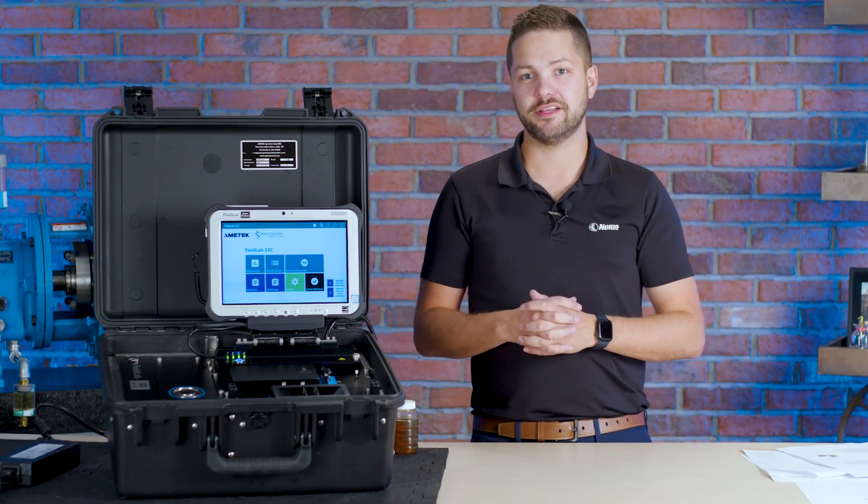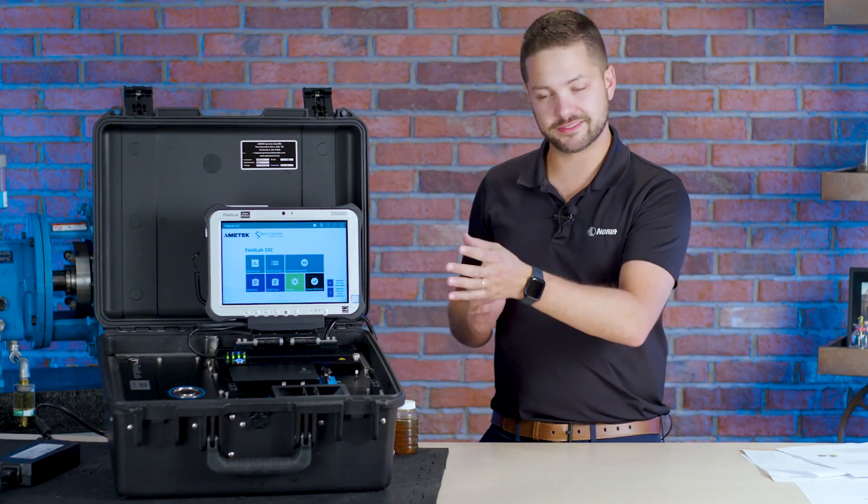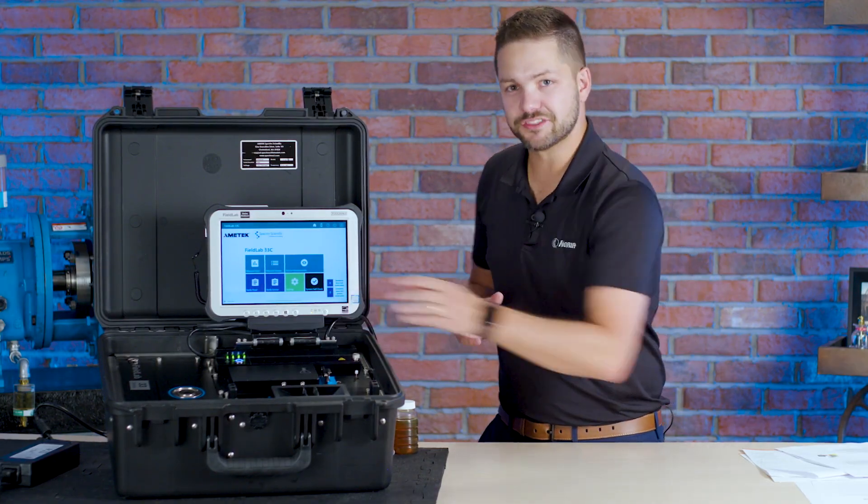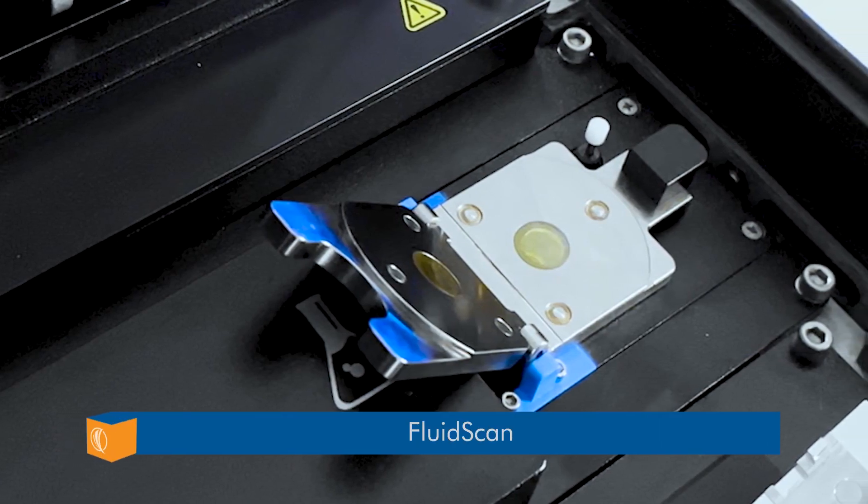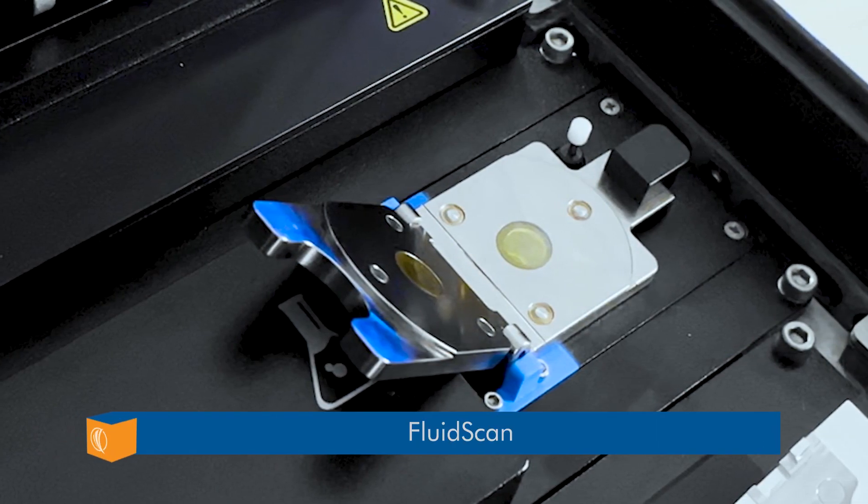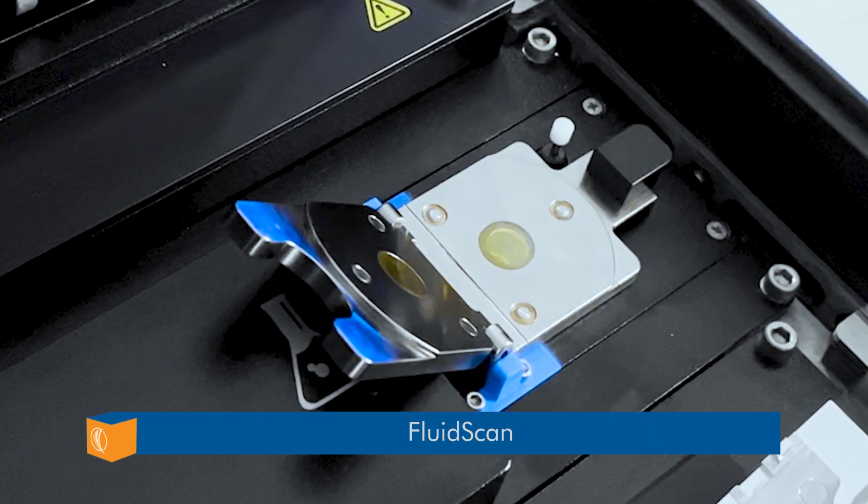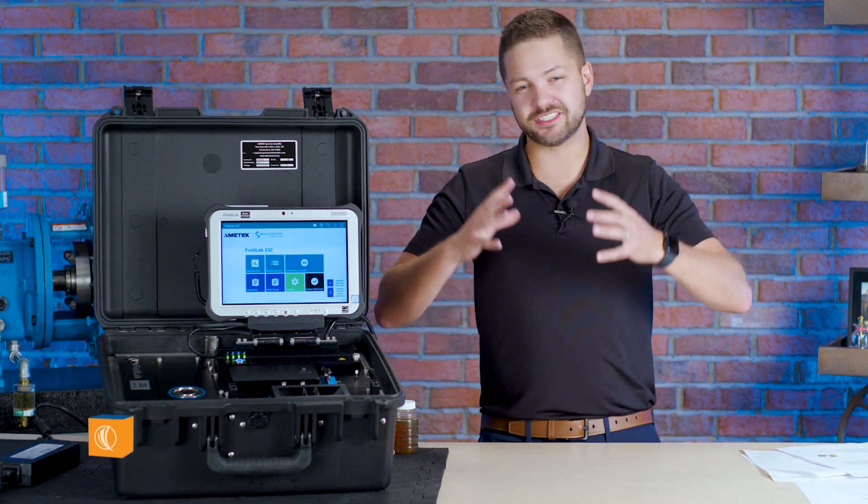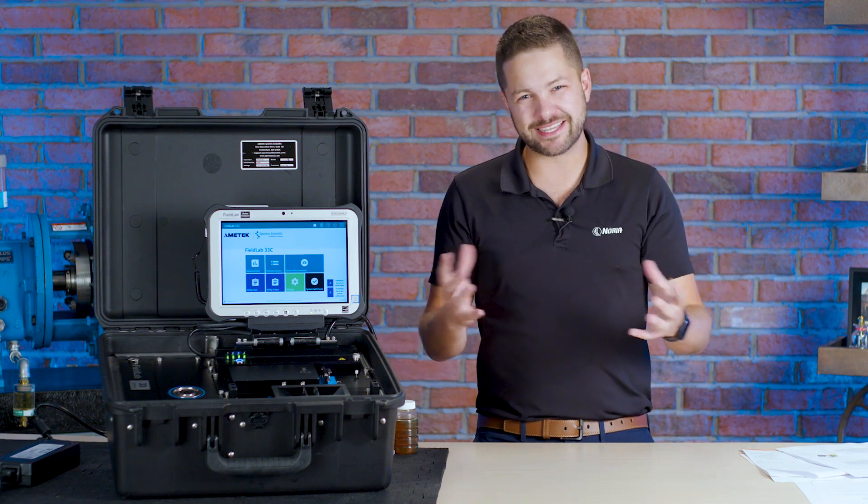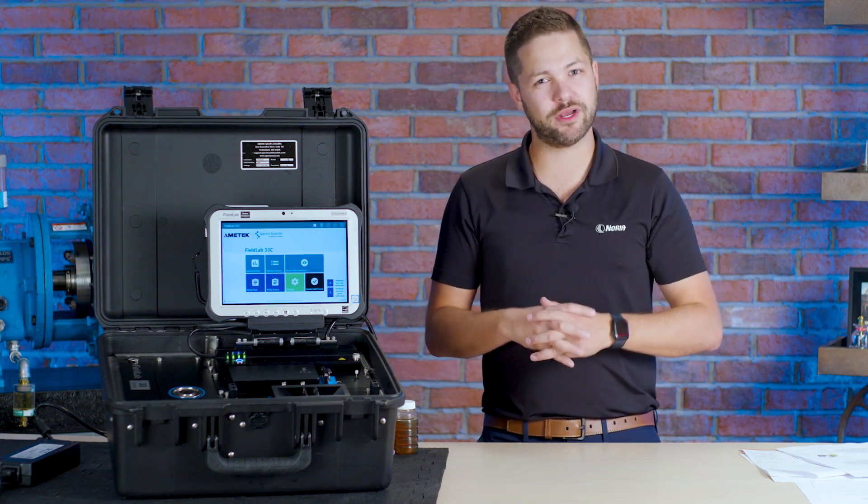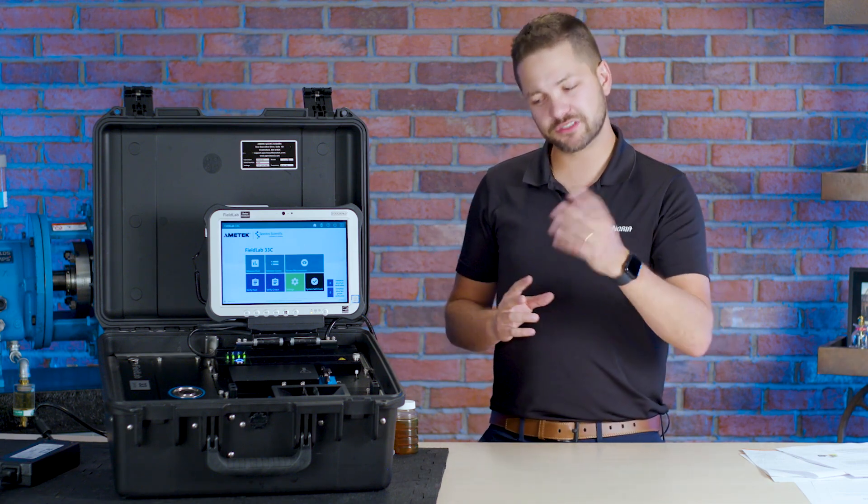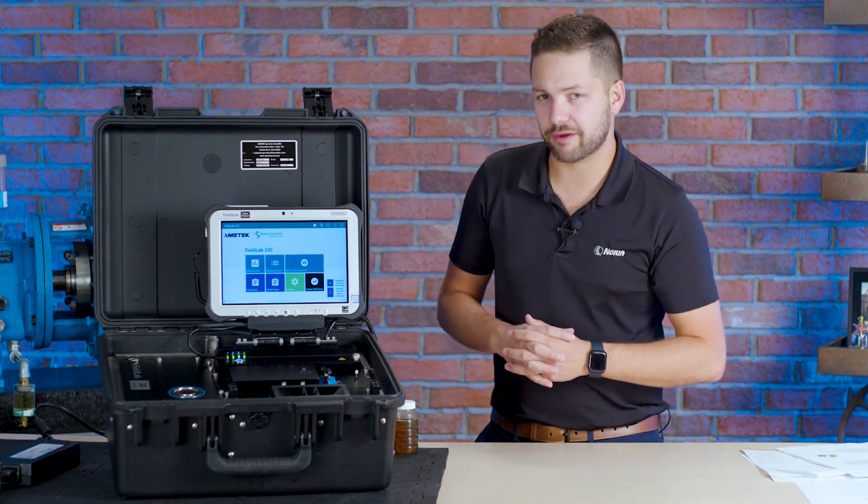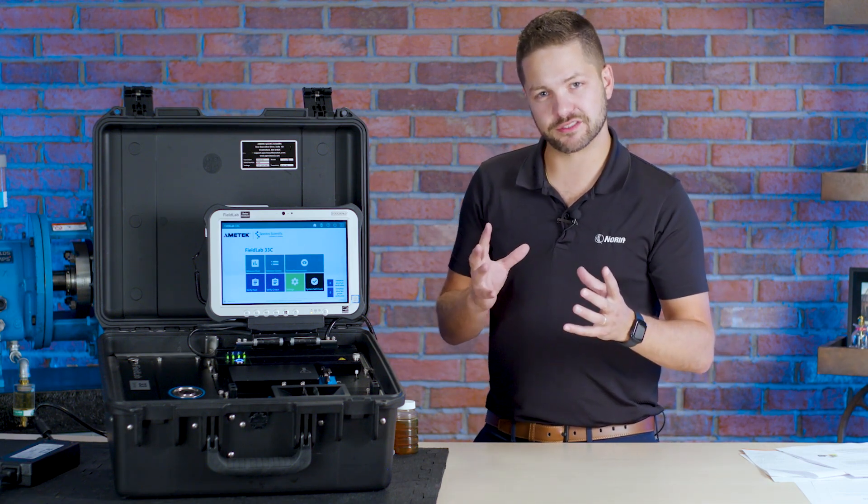We talk about that a lot in our training and so I'm glad that's in here. We also have the fluid scan. The fluid scan looks at different infrared parameters. This is the fluid chemistry as well as contaminants. So let's go into some detail about all three of those things.